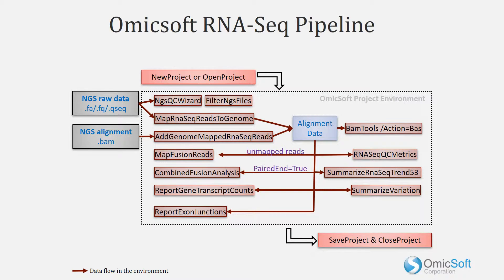Omicsoft's Array Studio contains a suite of modules to perform complete analysis of RNA-seq data. Much of this analysis can be performed with only a few mouse clicks using the RNA-seq pipeline. Starting with raw FASTQ files, data will be used for raw QC, filtering and trimming of reads, then will be aligned to the genome.